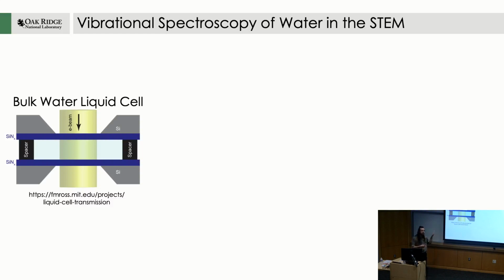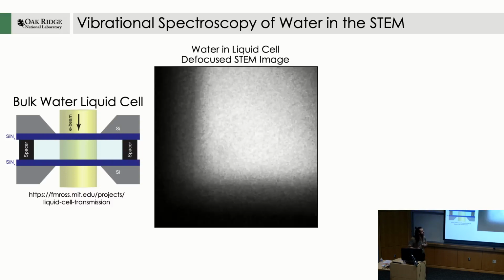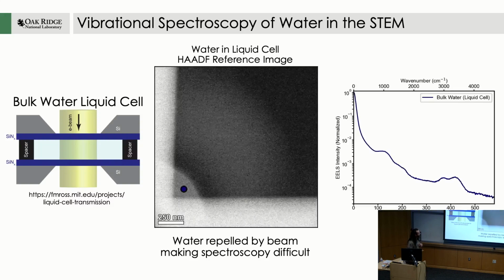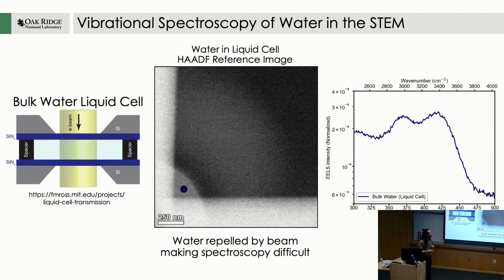The first experiment I'm going to show you is in a traditional liquid cell. This is a silicon chip with silicon nitride windows, and there's just a spacer that allows hundreds of nanometers of water to be present in the sample. It's difficult to use because the water runs away from the electron beam. You take one quick image and it looks like this, and your next one looks like that, and so on and so forth, and the water is always running away from you. But eventually you can chase it into a corner, stick your beam on it, and get a spectrum. And so what we see here is two peaks.